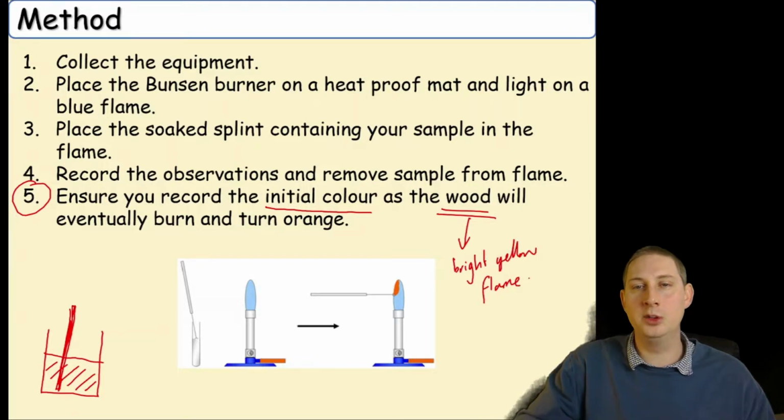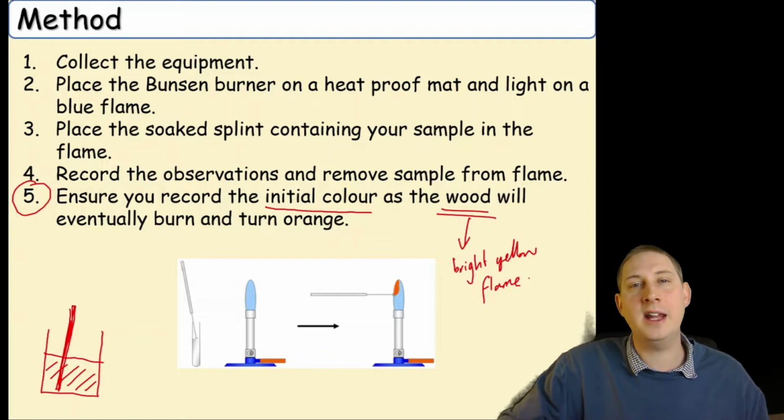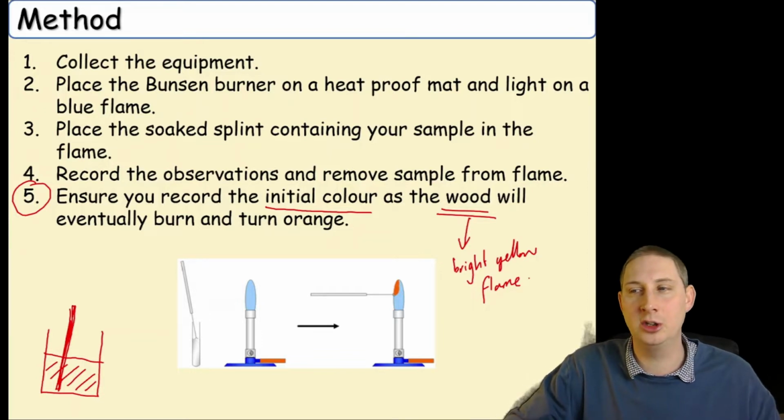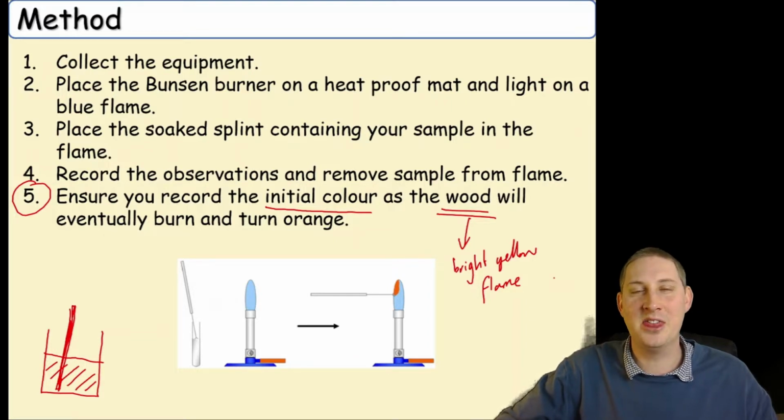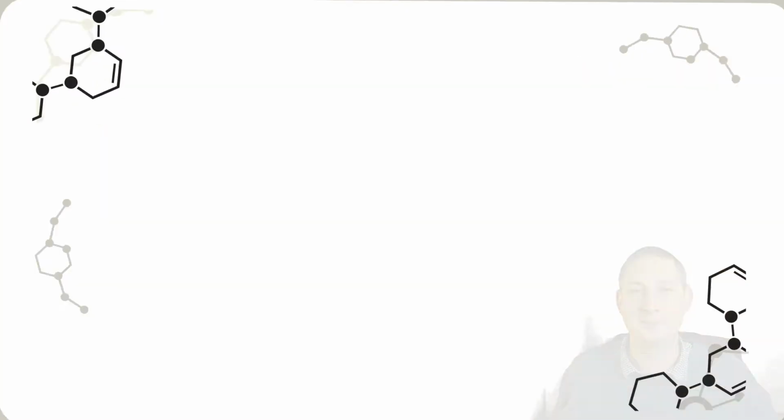So once the wood starts to burn, you're going to have contamination in the colour you're looking at. So this is me and Mr. Reeves doing that experiment a couple of days ago. I hope it is informative.